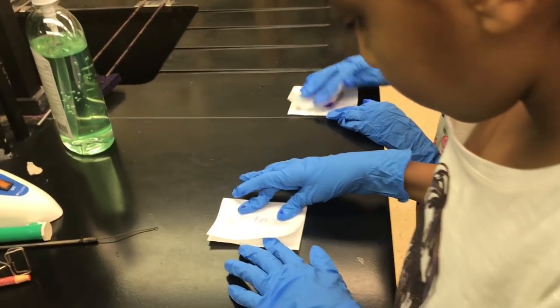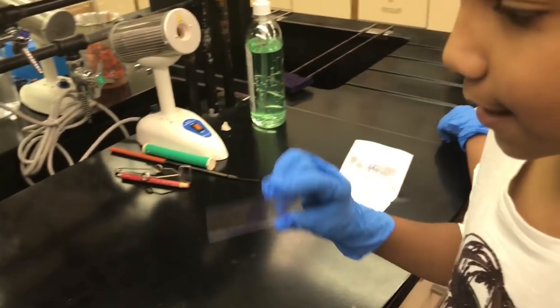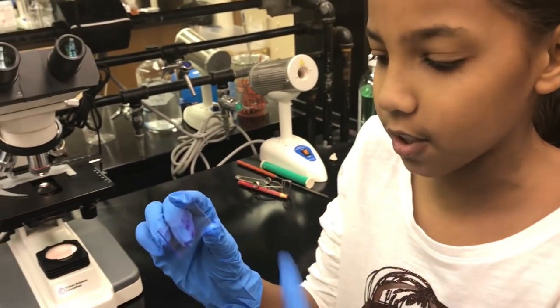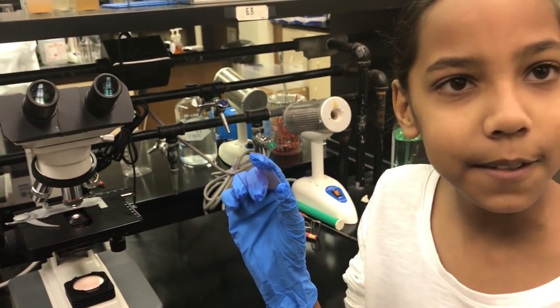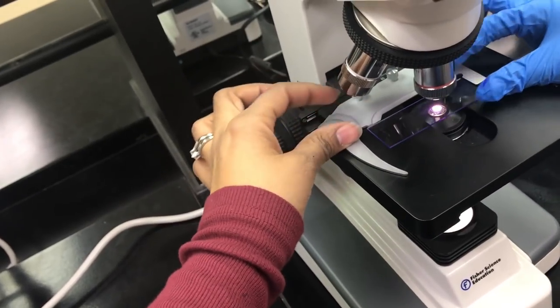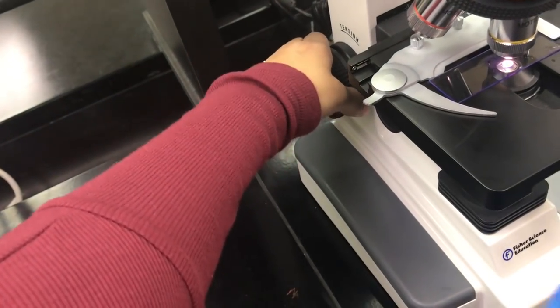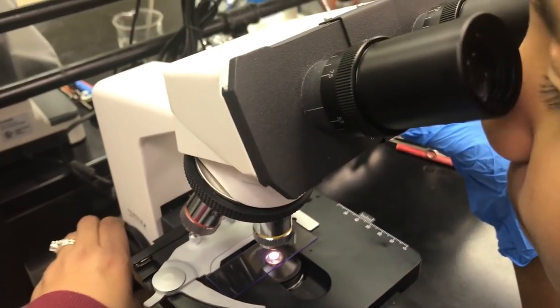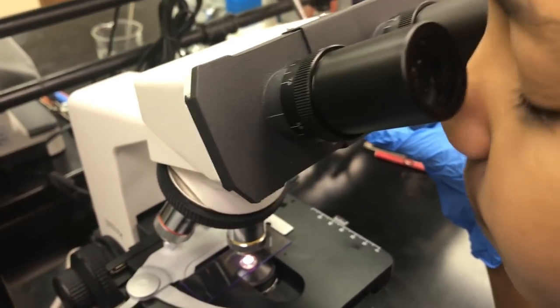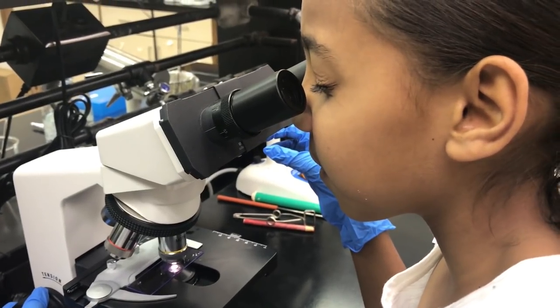All right, so now we're going to look at this. We're going to be putting these under the microscope. What it's going to do is make the bacteria on the slide look big. These are the objective lenses. I'll start off with low power, and then you look through and focus it till you see something. Use the coarse adjustment knob, the big knob, first. Purple dots come into view.